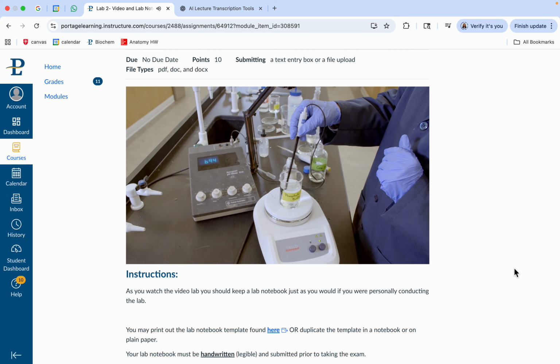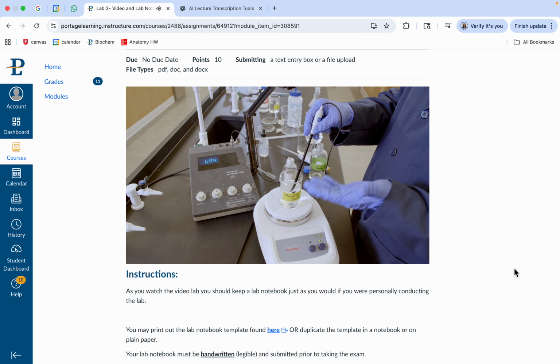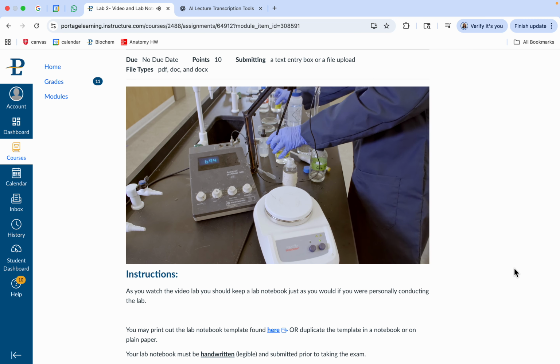Add some HCl to the solution, and we'll stir it up just a little bit. You'll notice, of course, adding acid to a buffer should lower the pH, and it goes down just a little bit, right? From 6.97 to about 6.94, and it's bouncing around. So there's not been much change in the pH, it's been maintained, which is one of the goals of a buffer, to help maintain the pH.